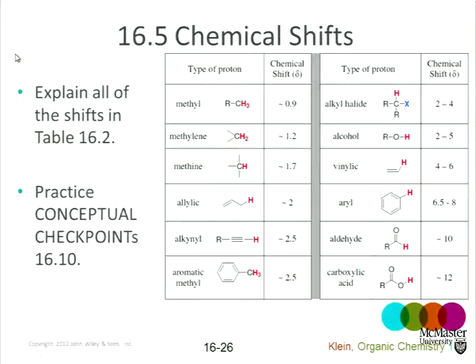And so here's the third part of the puzzle. If I have all of this data plus the proton NMR, now in the proton NMR, if I see something at about 10 ppm, I've got an aldehyde. If I don't, I know I've got a carbonyl group. It's not an aldehyde. Therefore, I have a ketone. Okay? It's all about putting all the bits together, the carbon data, the proton data, and so on and so forth.